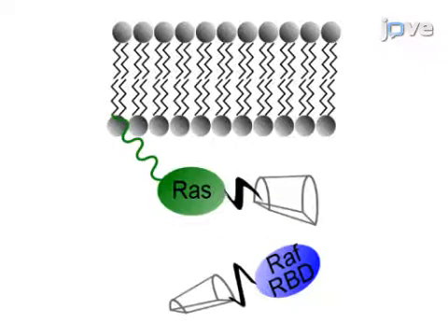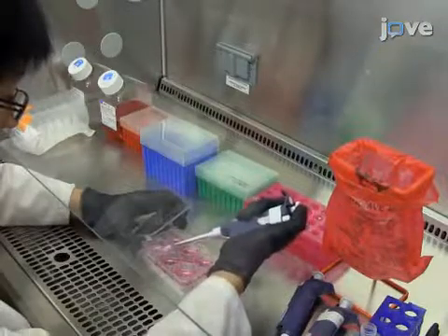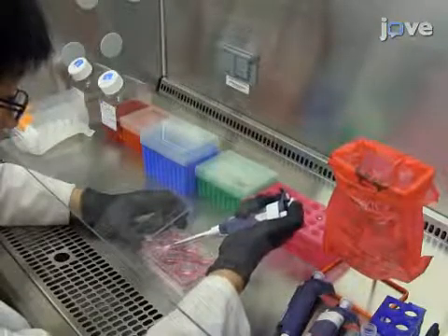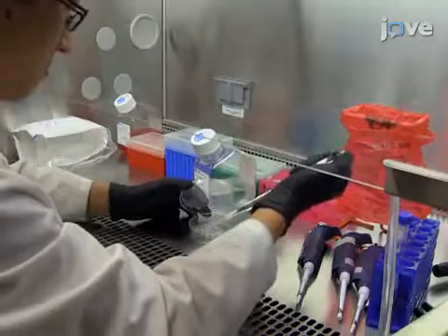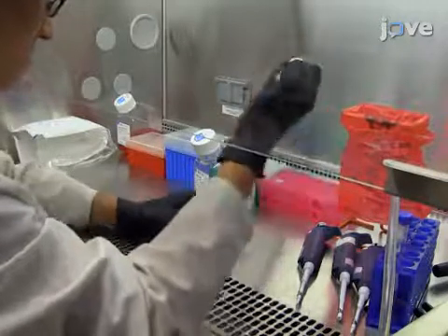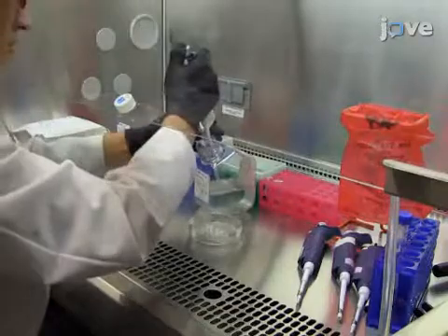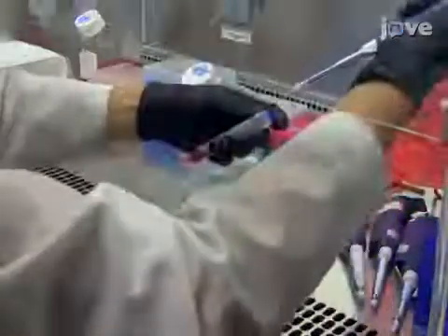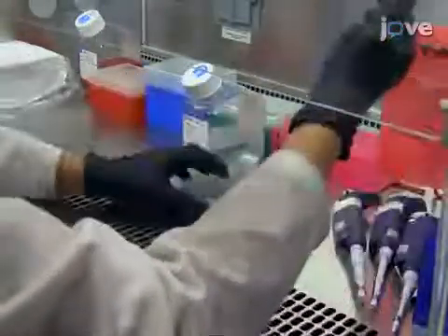After cloning RAS and RAF RBD PAM CHERRY1 fragments, packaging into viral particles, and infecting U2-OS cells according to the TEX protocol, to prepare a sample for imaging, plate about 5.5 times 10 to the 4th stable expression cells per well of an 8-well glass-bottom chamber slide in 350 microliters of phenol-red-free DMEM.